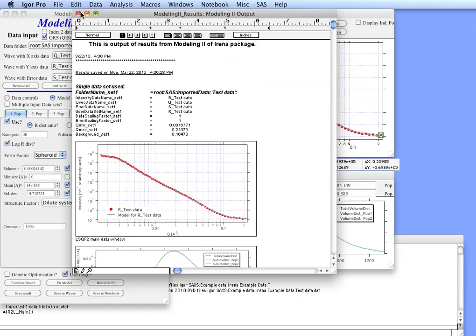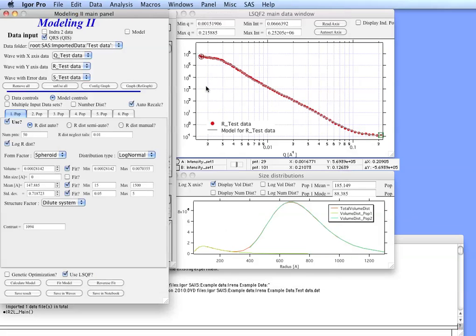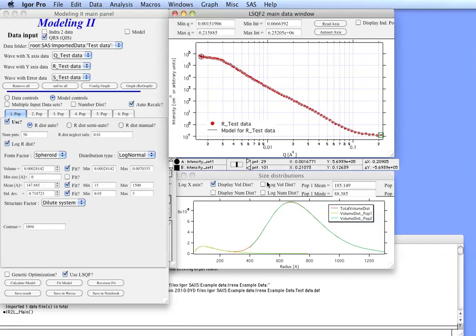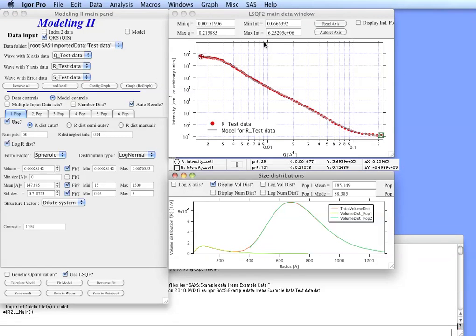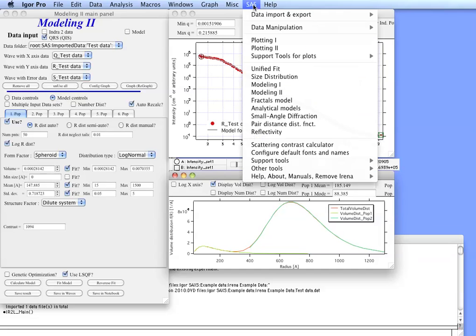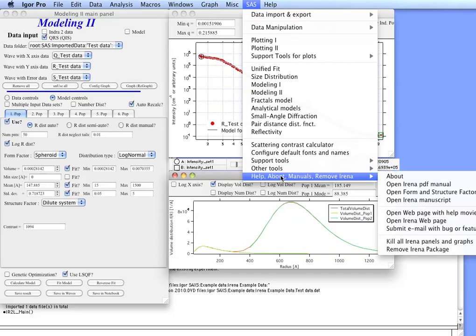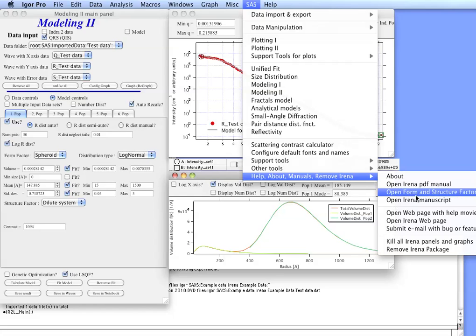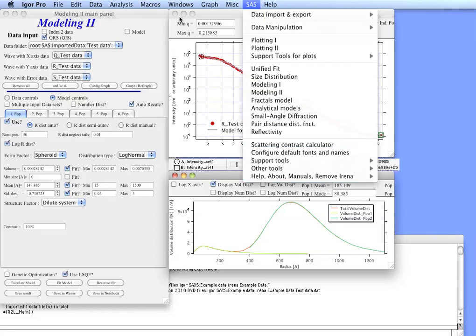Anyway, so now you have the results which you can then compare with the other tools, for example size distributions. Now in case you need more information, I'd like to draw your attention to a PDF manual which you can open directly from the menu here and form and structure factor description. These two PDF documents will provide you with much more information necessary for using successfully the modeling tool. Thank you.